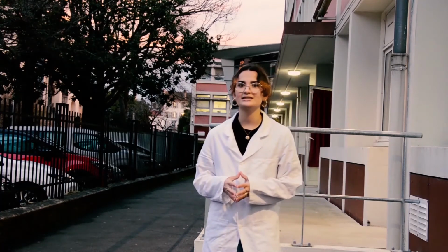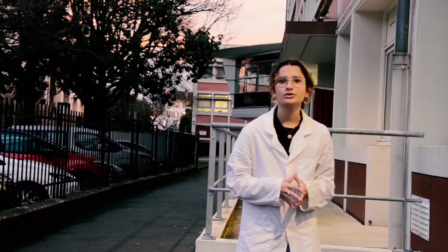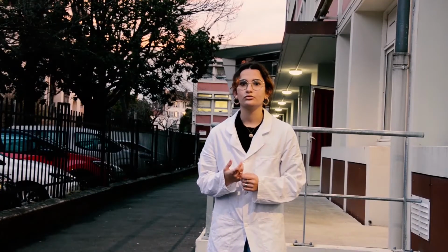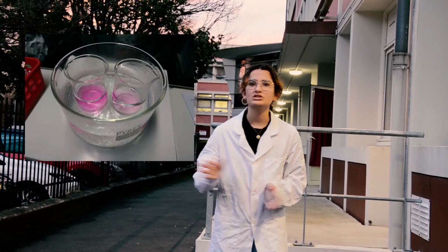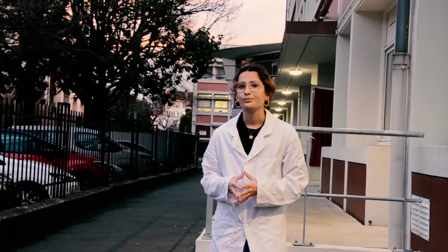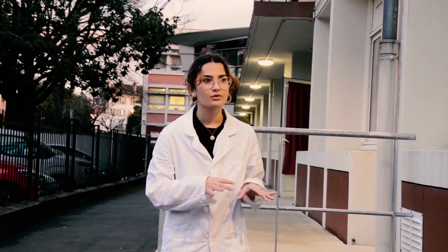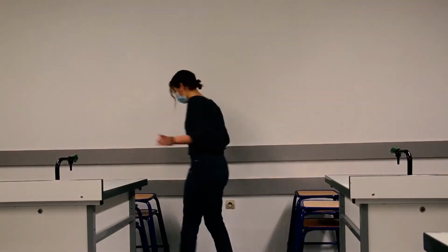We are going to do an experiment to see if the concentration of the reagent is a kinetic factor. At the end of the reaction, you can see that the one with the higher concentration is the one that reacts faster, and the one with the less concentrated reagent is a lot slower. To understand this result, I'm going to draw a parallel with a room with a certain amount of boys and girls.